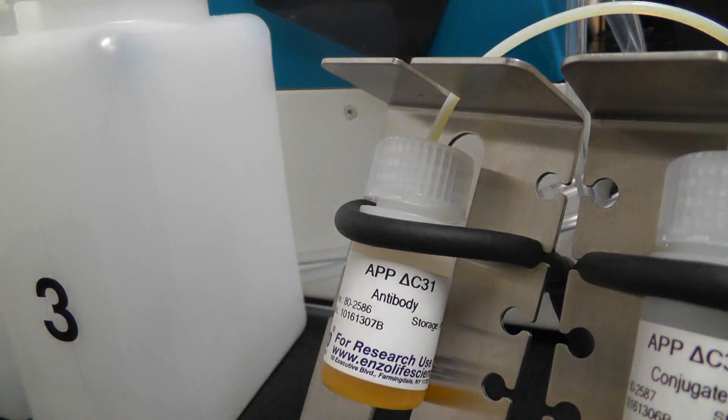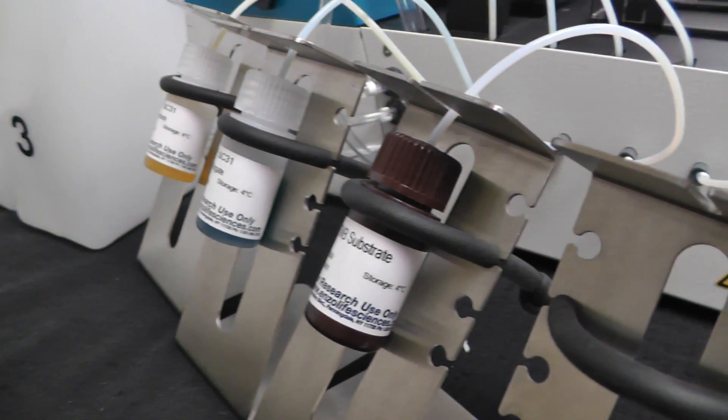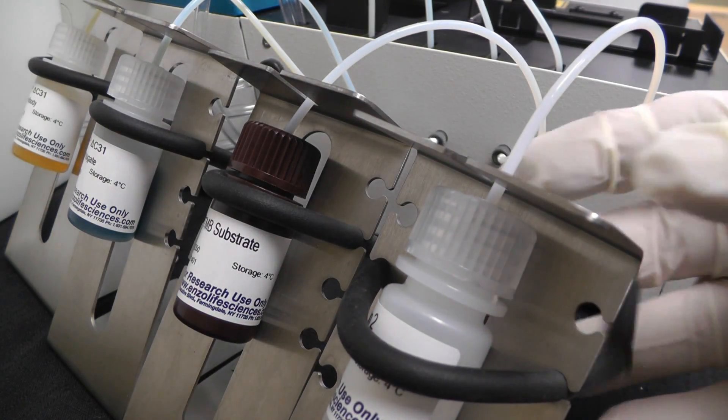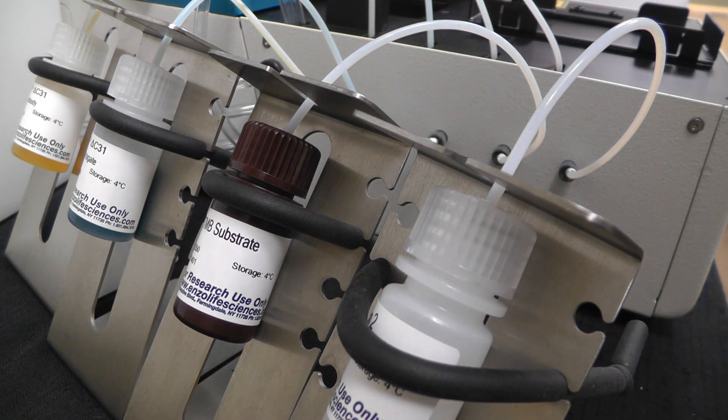We prepare the Crocodile Mini Workstation by adding all reagent bottles to dispensers 1-4. This includes the conjugate, antibody, substrate, and stop solution.